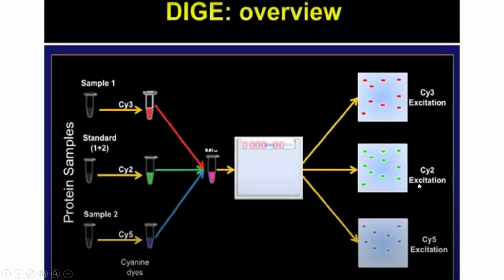If you see, this is your internal standard. This protein is specifically coming from the control sample, but it was not present in the disease sample. If you want to identify this protein and check why it was not present in the disease sample, you'll understand this is a protein generally responsible for keeping the control sample safe, and in the disease sample, for example, that specific protein is not produced at all, and that's the reason that person might be suffering from that disease. Similarly, this specific protein is also present in control only and not in the diseased one. That's how you can compare these results and make sure that it is already present in the internal standard as well, so that it is not coming from anywhere else but from the sample itself. That's how you can do the analysis just by visualizing, but we can actually know the intensity etc. by uploading it into the software and checking everything about it.